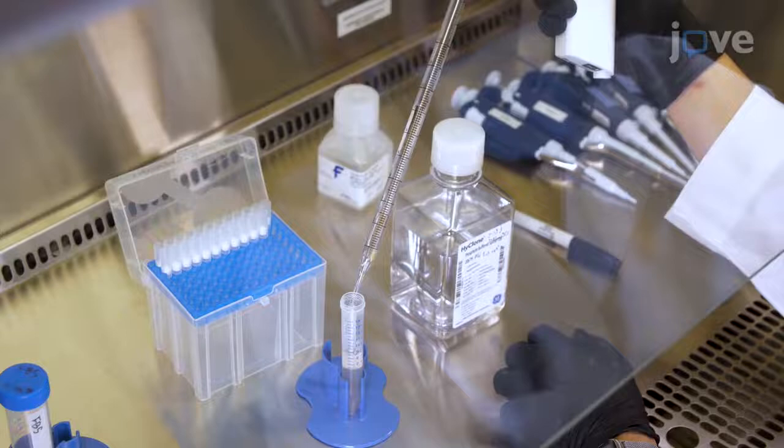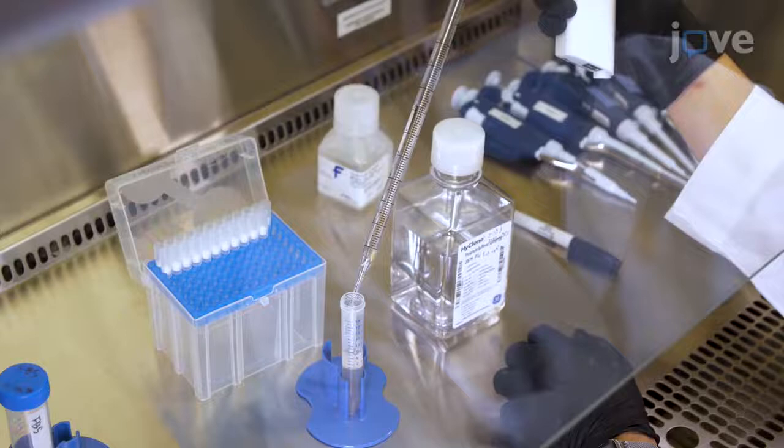Bring the volume to 15 milliliters with sterile PBS. Then cap the tube and invert it gently 2 to 3 times.